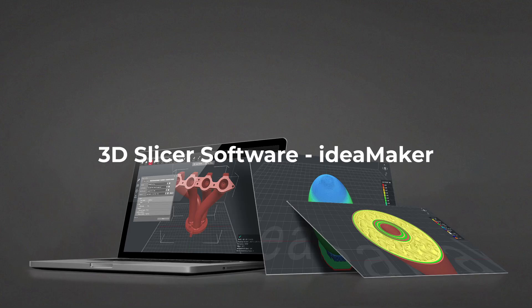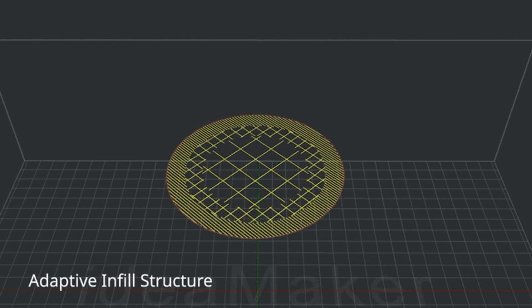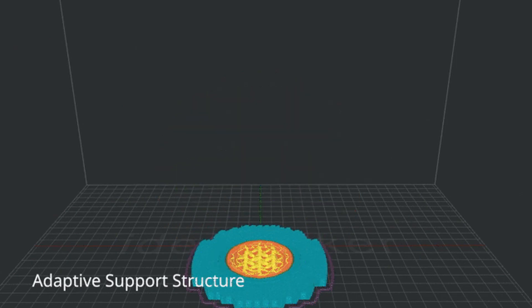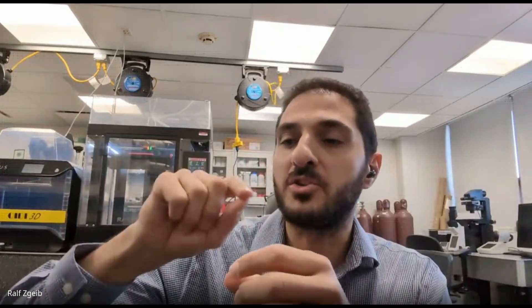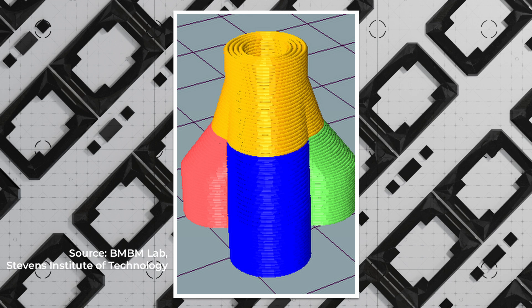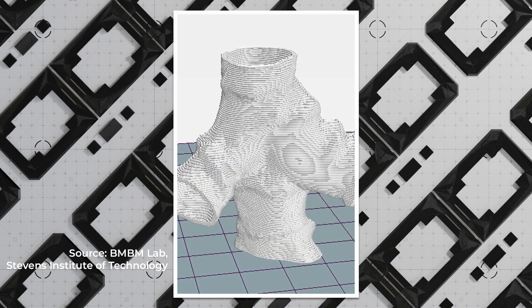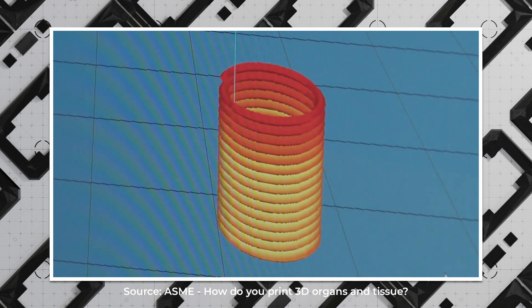So I really love the slicer. It gives consistent and solid results, and the toolpaths are really nice. I also use it to 3D print the biomaterial. I can put any structure and I can control the direction and angle of the infill and the toolpath, which is pretty awesome. Since it's kind of open source, you can also use it for many things.